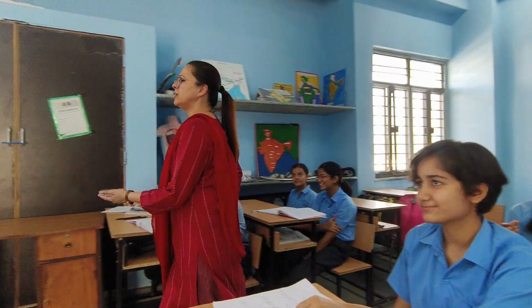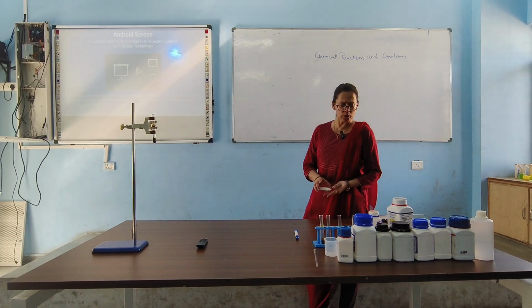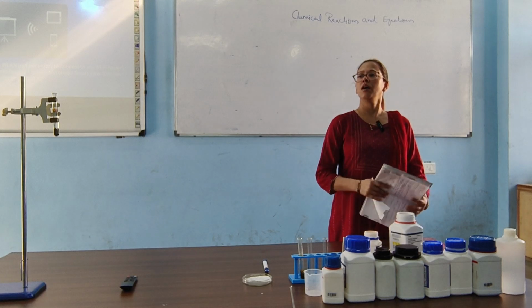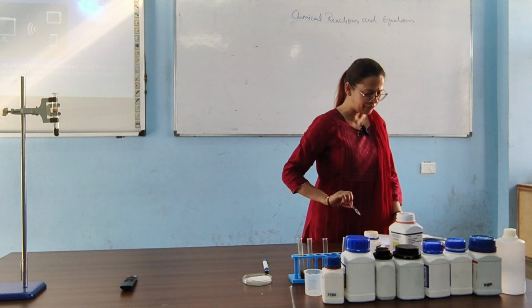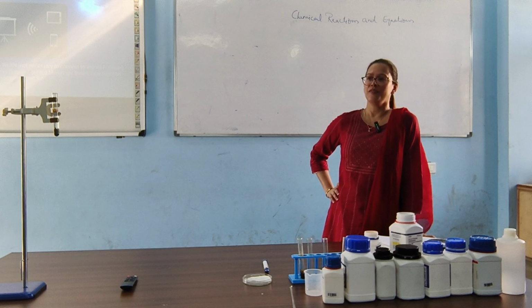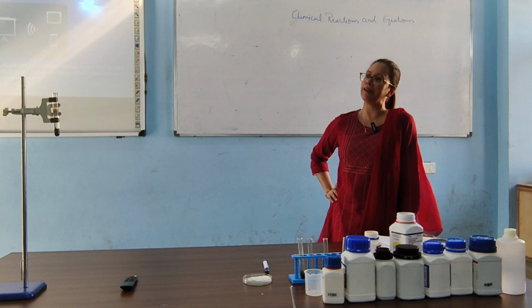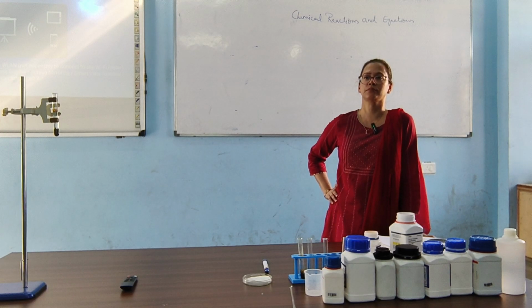Okay, this is white in color, right? What all did we see today before lead nitrate? Ferrous sulfate, what was the color of ferrous sulfate? Okay, what are we going to do with lead nitrate today? We are going to heat everything today, right? So we are going to heat lead nitrate again. Now I want somebody on the board, they come on the board.